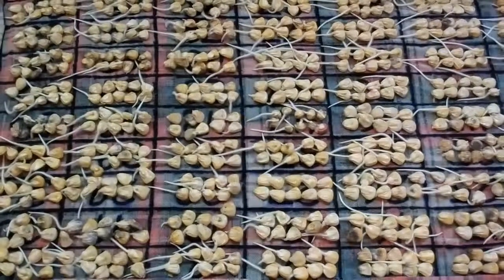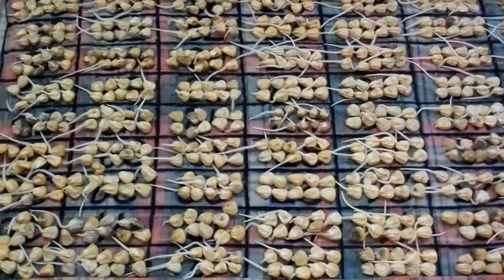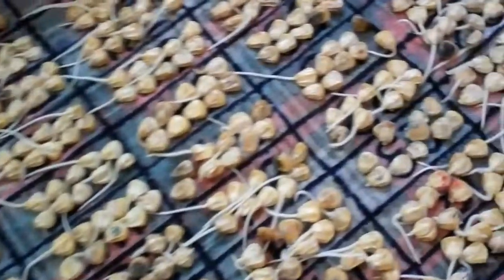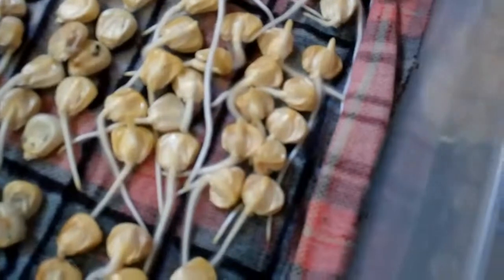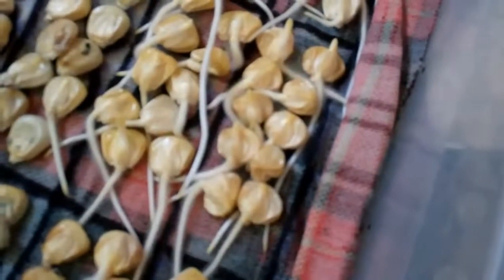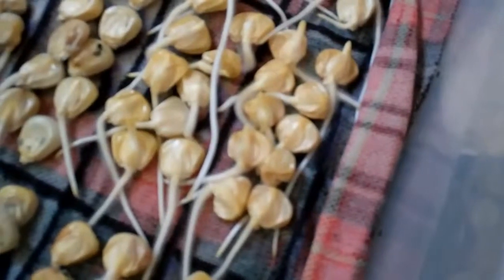After two weeks of 50 to 60 degree temperatures, what does this sweet corn look like? Let's take a nice close-up. Here are a couple of families — each of these have very long roots. They also have shoots extending about a quarter inch or so. It looks like every seed germinated and the shoots are coming along. That's quite strong.